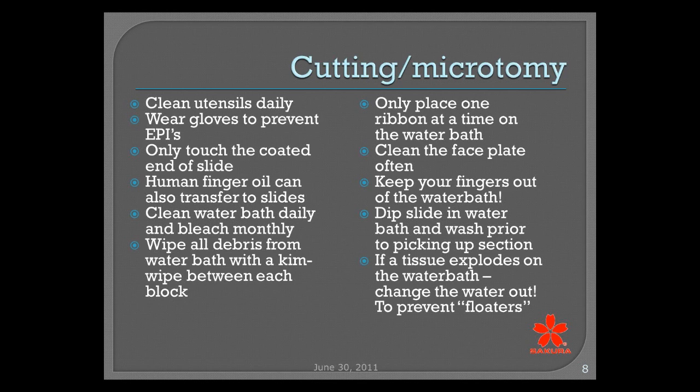Then at cutting and microtomy, one of the things that I have learned, just in my teaching years, is that it's very simple to forget about your utensils. We all know that we need to clean our water baths, but our utensils, our little paintbrushes and forceps that we use, we tend to just throw right back into the bucket that we hold them in and forget about them. So I train my techs to, when they clean their water bath, also clean their utensils. You can pick up small little particles on your paintbrushes and on your forceps that you're using to cut, and those are going to carry over into other cases.